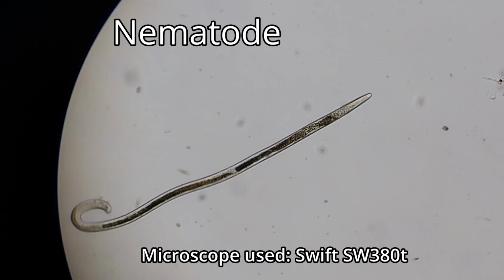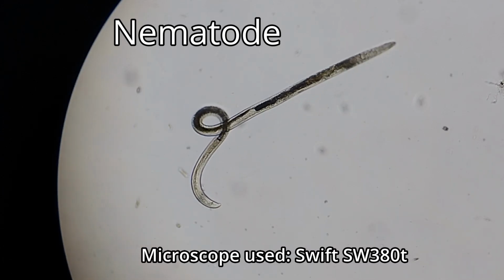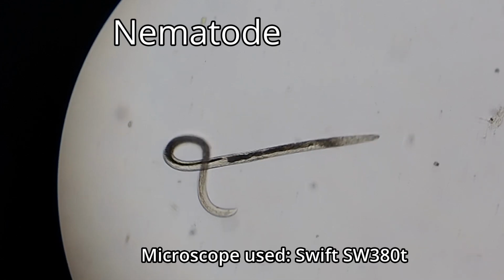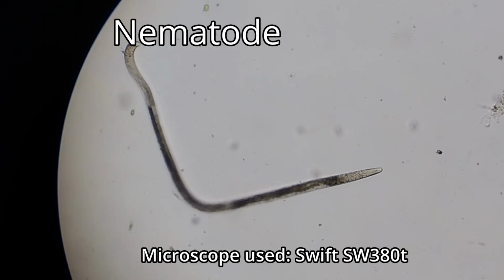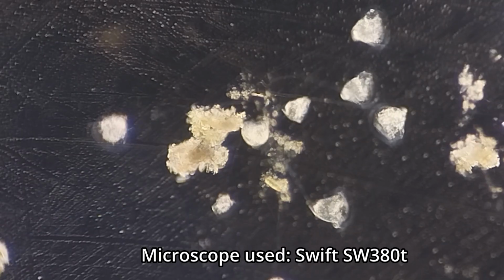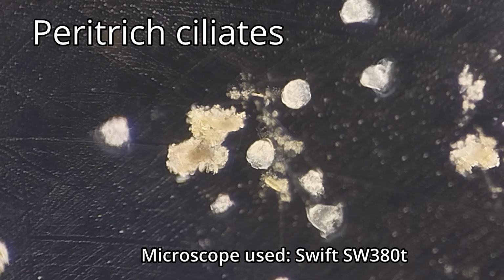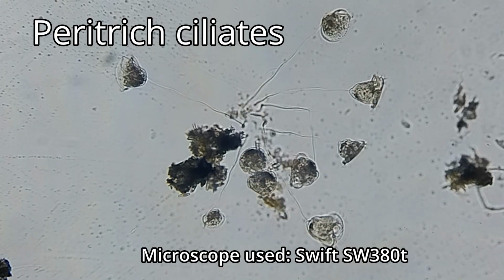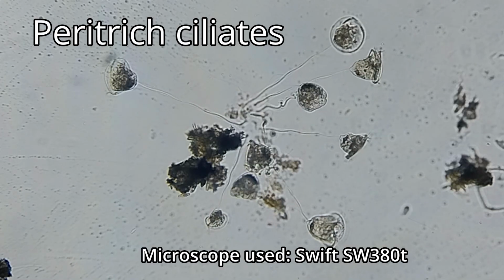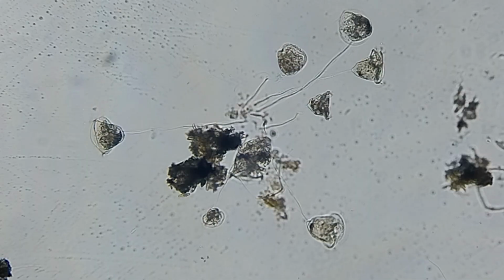This worm is another microanimal. It is known as a nematode worm. I find nematodes in almost every sample that I collect, whether it's moss, freshwater, or soil. This is a colony of peritrich ciliates. Their bell-shaped bodies are attached to stalks, and these stalks are attached to surfaces. They contract rapidly when disturbed. Peritrich ciliates have a ring of cilia around their bodies. This ring is used to draw in food particles.